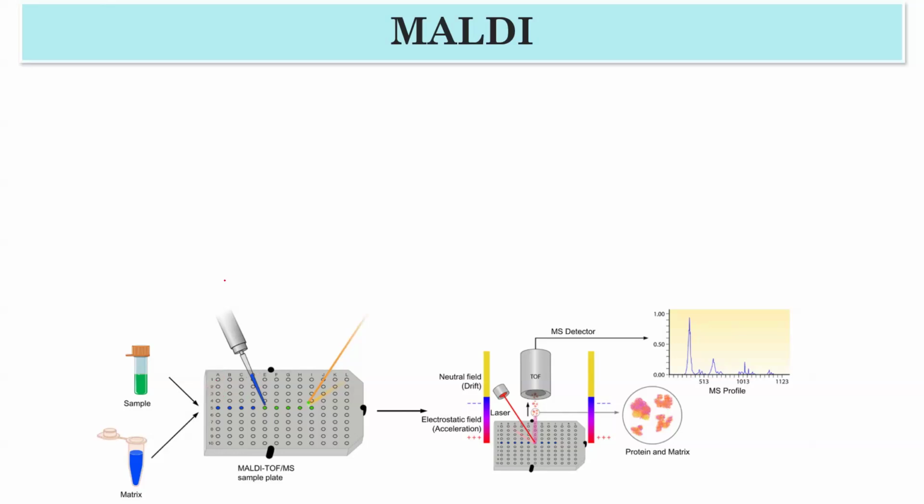In your software on the PC connected to this multi-sample instrument, there will be an option to say where your sample is. You can say A1 is my sample, suppose C3 is my sample, B4 is my sample, and then it will analyze those samples.